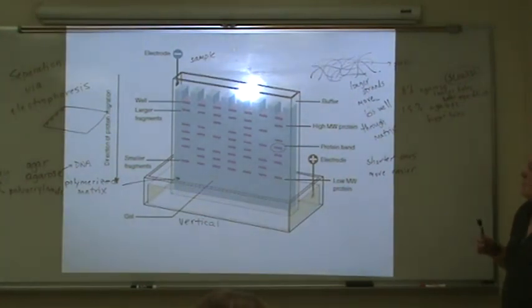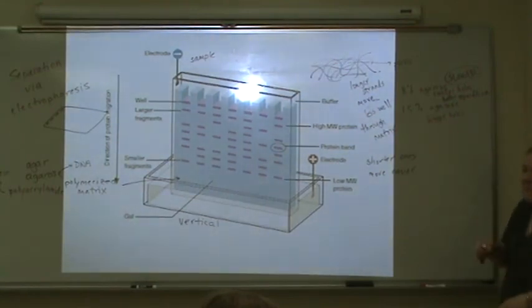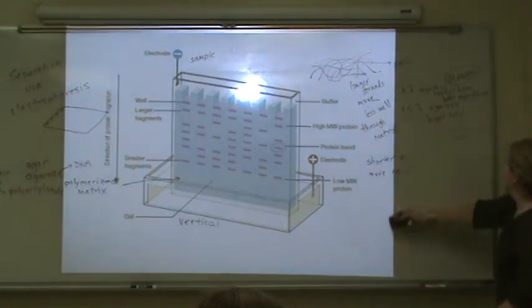So if we had a person with an 8-foot long lumber and a person with a 7.75 foot long lumber, if you made them run through a dense forest long enough, that's a small difference, but the one with a slightly longer lumber would eventually get behind. If you use a lower percent agarose gel, they're more fragile or floppy. You can like bend them, feeling silly. They have bigger holes. They have less separating power.